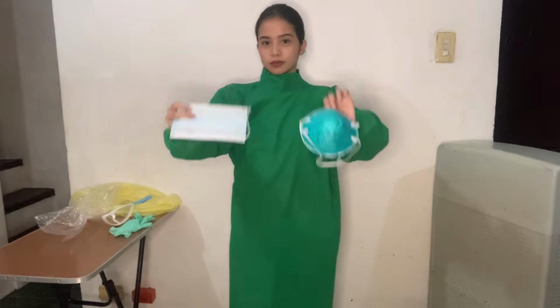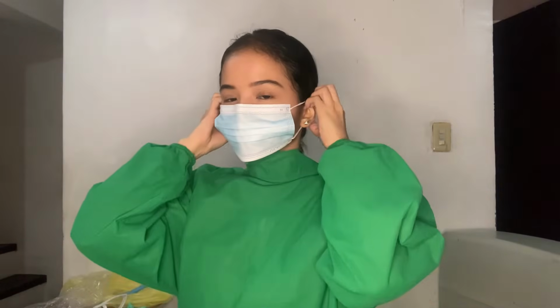Wear the appropriate type of mask. For a surgical or ear loop mask, place the mask over the nose, mouth, and chin. Make sure to flatten the metal piece over the nose bridge. Then you can adjust the mask to fit your face.